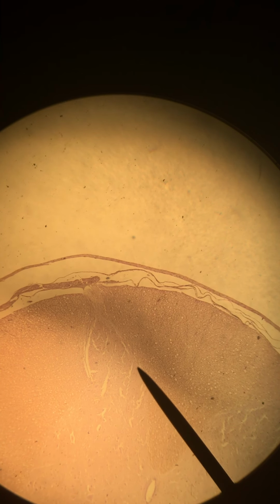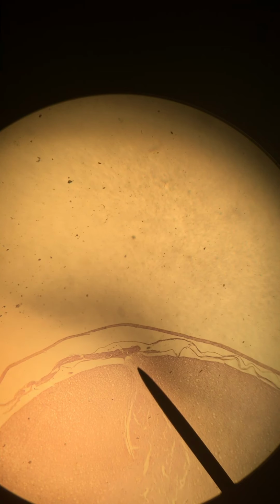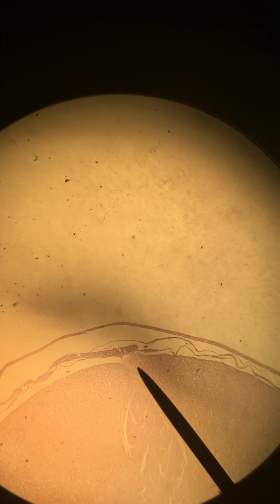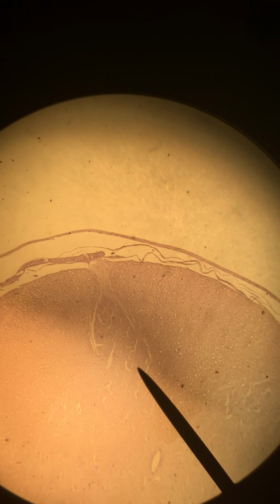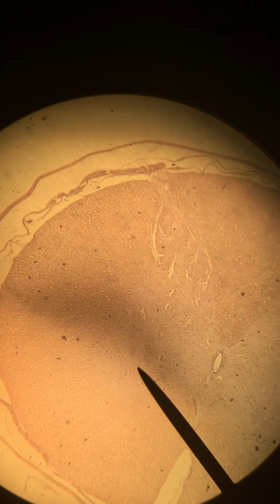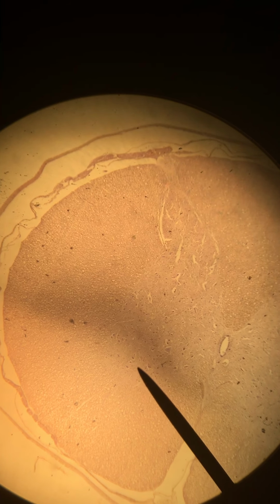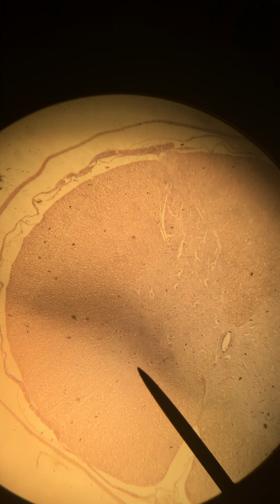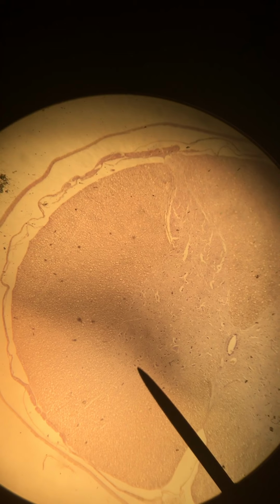dorsal and ventral protrusions. So this here, where I'm drawing the line along now with the pointer, leads to the dorsal root. Okay, so this is where the sensory information is coming in to the spinal cord. All right, and then in the gray matter, you have here all of our cell bodies. If we're going to be in the ventral side, which I'm moving towards here, these are now going to be motor neurons, which are transmitting information. Okay, and the gray matter holds the cell bodies.